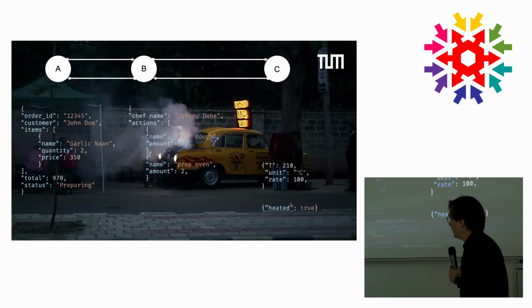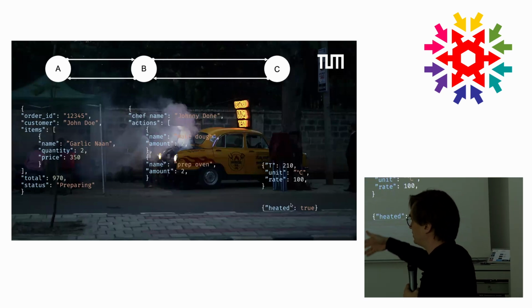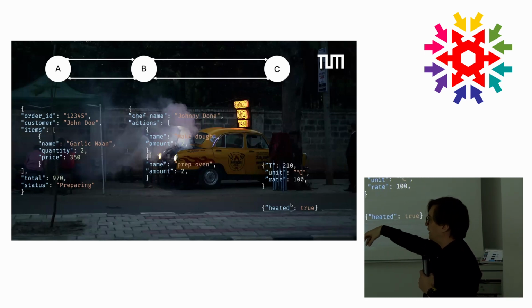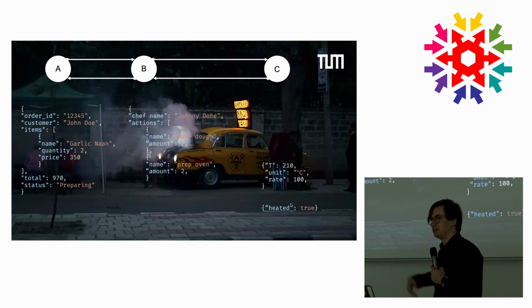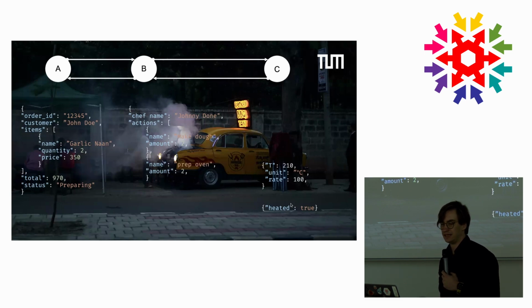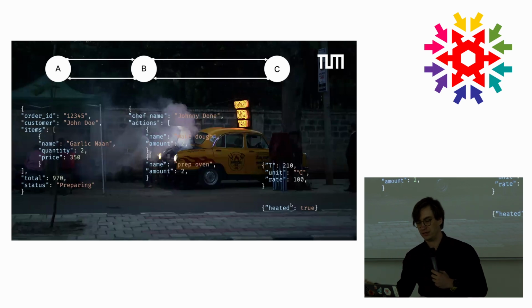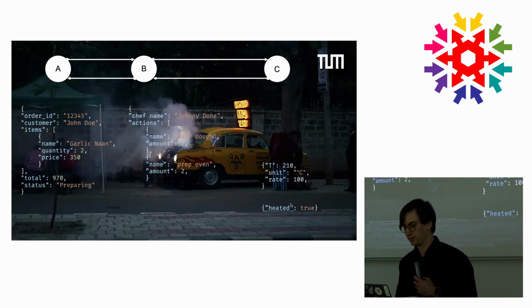So the way we typically automate our lab is we have some JSON-like instructions. This can be relatively high level. So in this case, it would be make me a garlic naan. And then we need to translate these higher level instructions into a sequence of events. So these are actions, for instance, you can make a dough, you can prep an oven. And then you need to be able to translate these still relatively high level actions into things that are more atomic, such as you need to heat up an oven. And eventually your oven will need to tell you, okay, I'm heated up now, please continue.